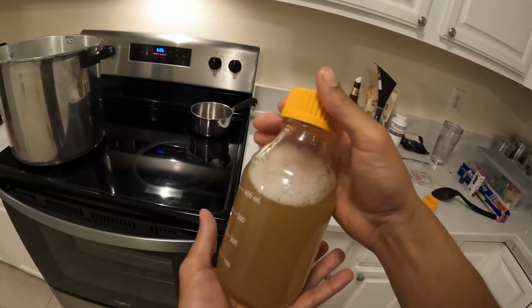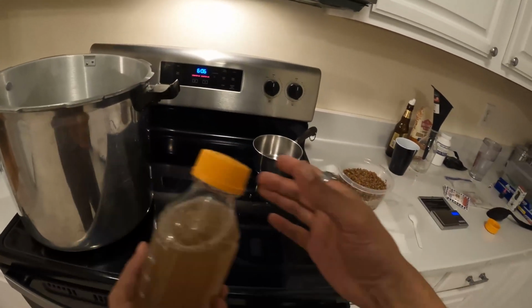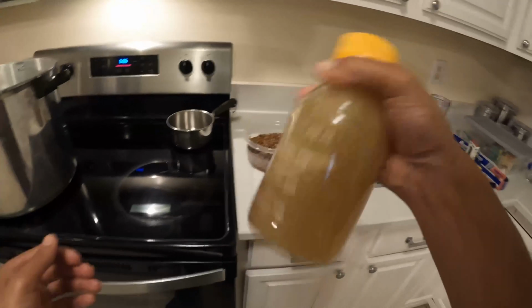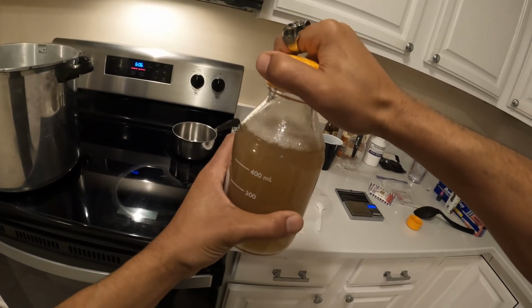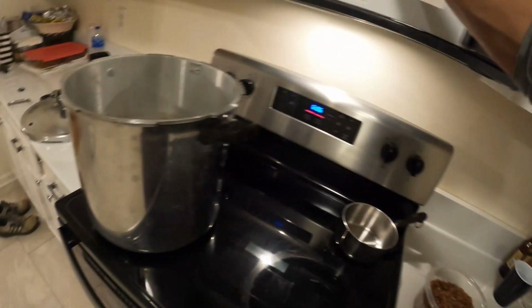Now if you put this stuff in the microwave, or if you do it on the stove, do not leave it whatsoever. It will boil over and you're going to have a huge mess. So just stay with it. It only takes a few minutes. Try not to get distracted. So take the cap and just slightly loosen it just a bit, and we'll go ahead and put that in the microwave.